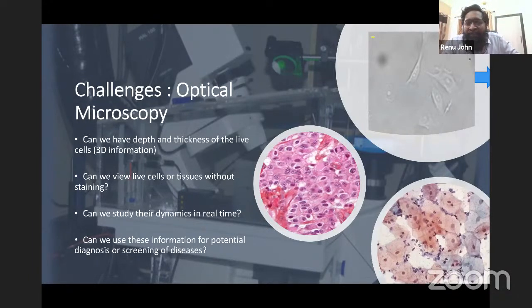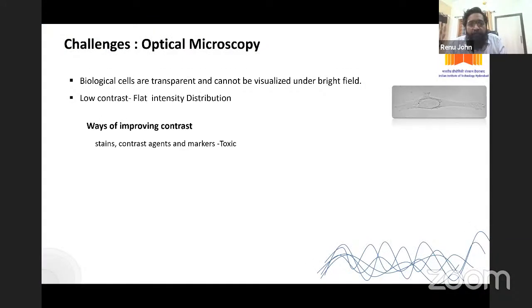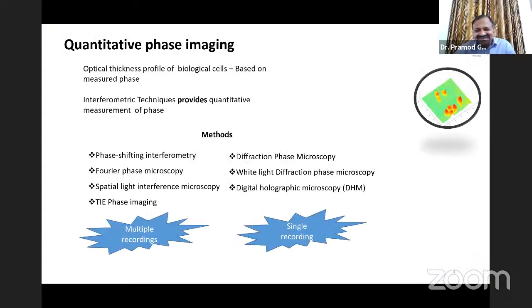I used this only for the incubation application, but I was folding the microscope objective back and shining the laser into it with external optics, and then using the laser to do the imaging. Microfluidics is very well possible. We have even flown cells into the channels and imaged them. It is very well possible. Thank you, Dr. Renu.